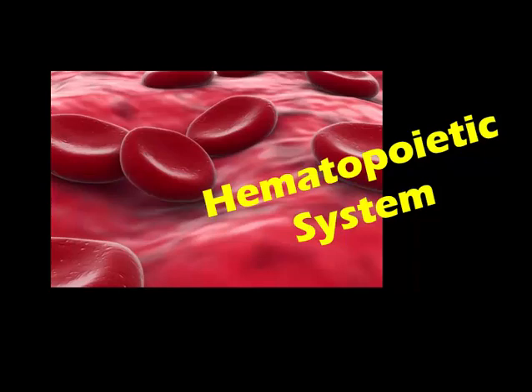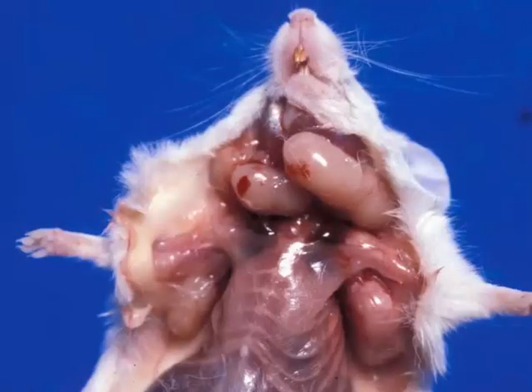Lymphoid infiltrates is a very common morphologic diagnosis when you are reading out studies involving older mice. And as a general rule, in lymphoproliferative diseases, lymphocytes often accumulate in large numbers first in these areas as well. Okay, got all that? Well, let's move on to look at some images.